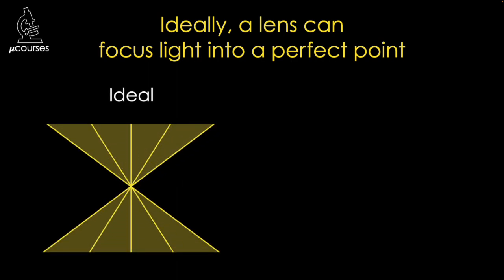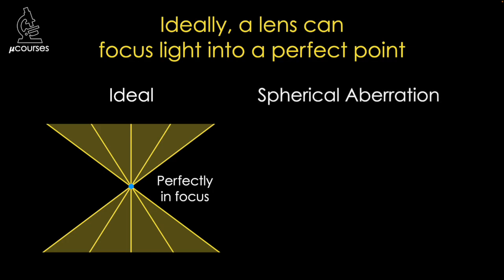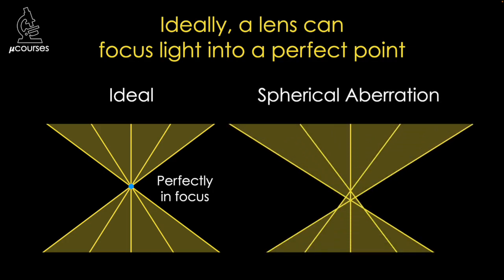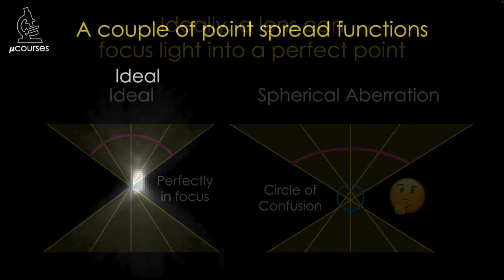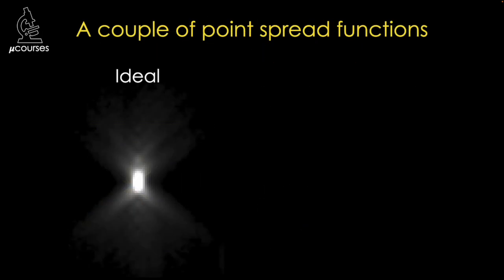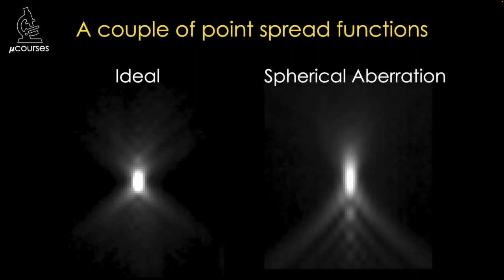Ideally, a lens is able to focus light into a single focal plane. When spherical aberration is present, light comes into focus at different planes, resulting in what is referred to as the circle of confusion. In an ideal lens, light maintains a spherical shape as it comes in and out of focus. Spherical aberration results in a deviation from the spherical shape, hence the name. A three-dimensional volume of images of a point source of light — here we're looking at an axial view — reveals the point spread function of the microscope and any aberrations that might be present.